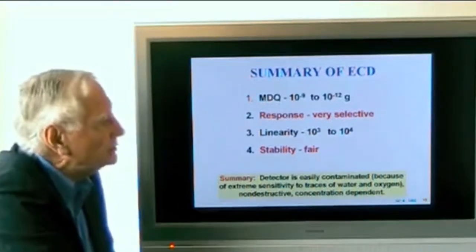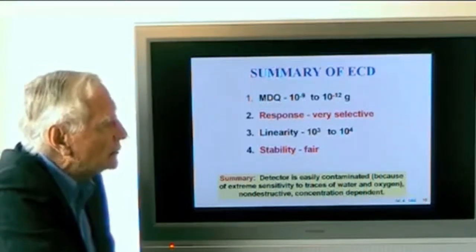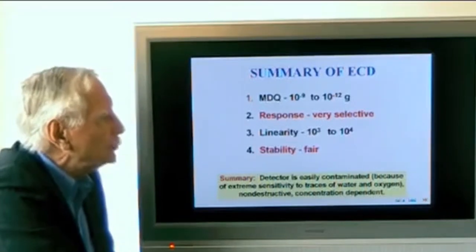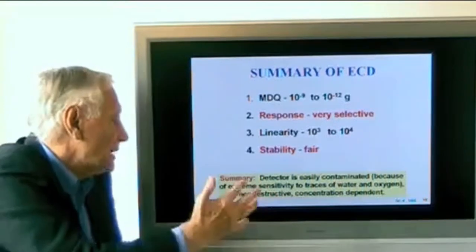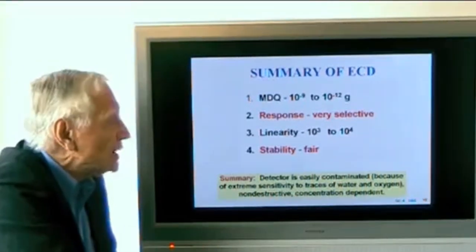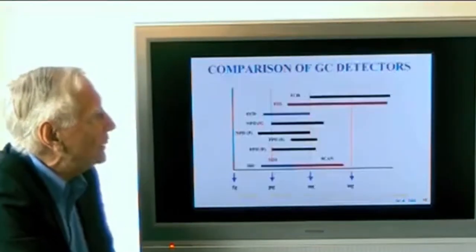Earlier estimates by FDA showed they felt a few years ago that daily there are more than 30,000 samples of pesticides in food done throughout the world on a regular basis. Today there's probably at least 35, 40, maybe 50,000 samples of pesticide in food done routinely on a daily basis by electron capture.